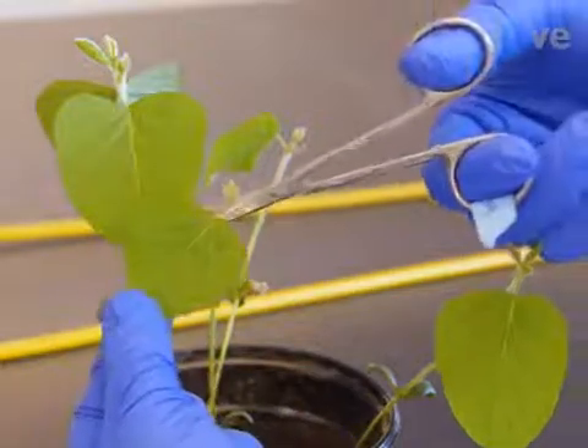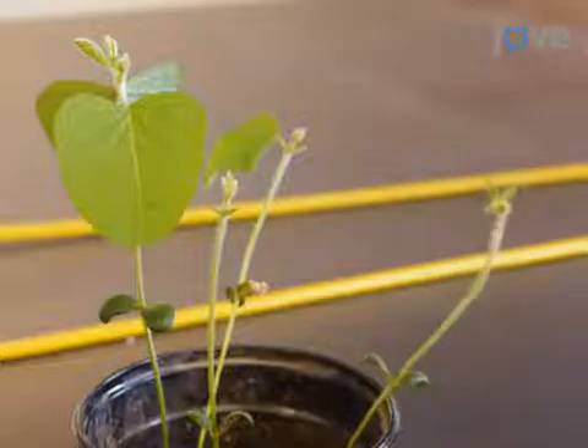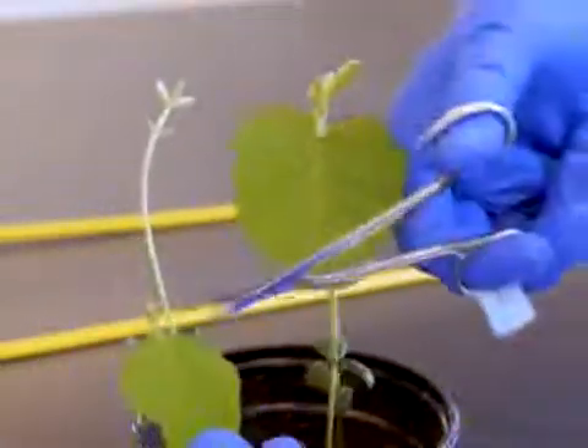Cut newly expanded unifoliate leaves from 10-day-old soybean seedlings. To ensure that one sample gives a high protoplast yield, collect at least three samples of unifoliate leaves at slightly different developmental stages.